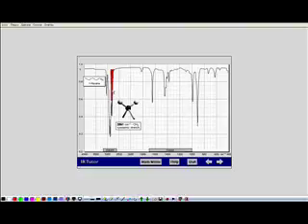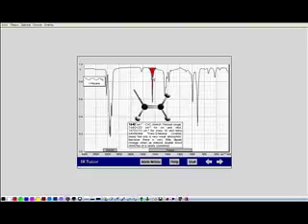Somewhere in here, the carbon-carbon double bond stretch is. It's at 1,600, but notice its intensity, the amount of dip isn't very much. So it's not a very intense peak by any stretch of the imagination. And sometimes we see it and sometimes we don't.